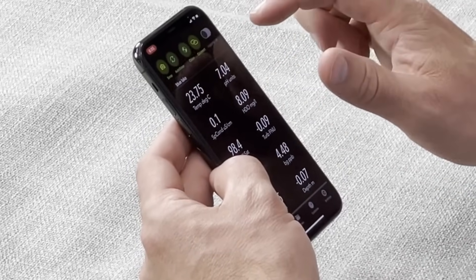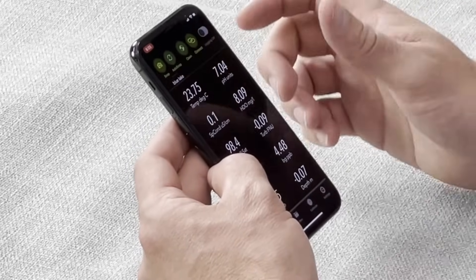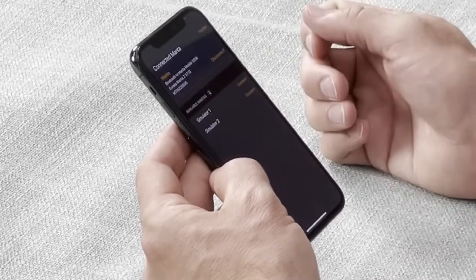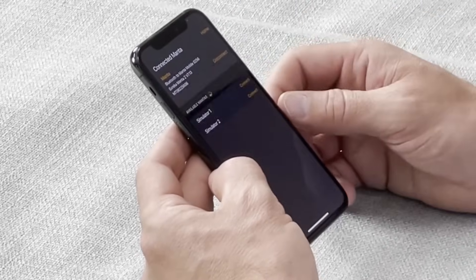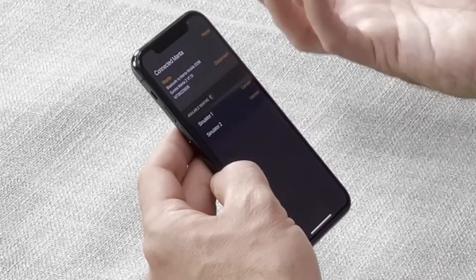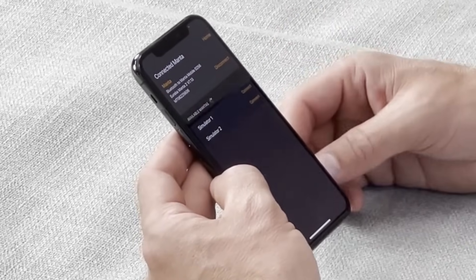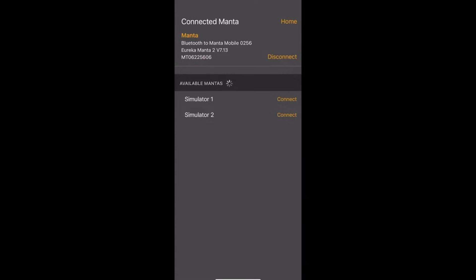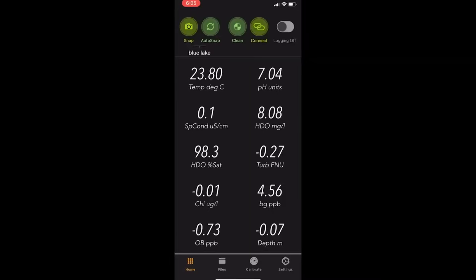The next hot button is the connect screen. That brings up any devices that are in range that you may want to connect to, as well as the simulators that are built in. Right now it's just telling me that I'm connected to this multi-probe. It gives me the serial number and the Manta mobile ID. I'm going to click home to go back to home.